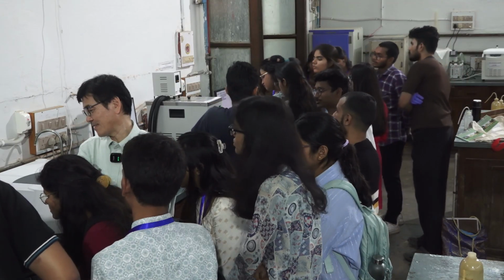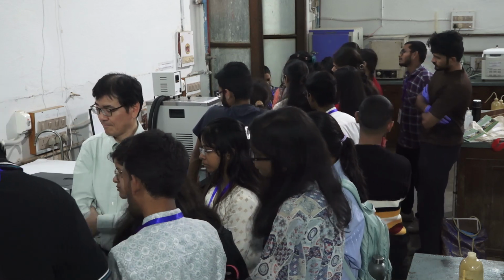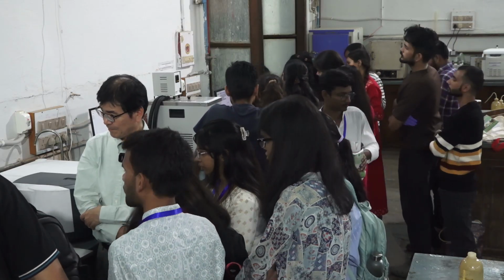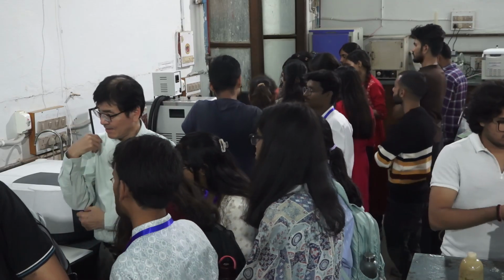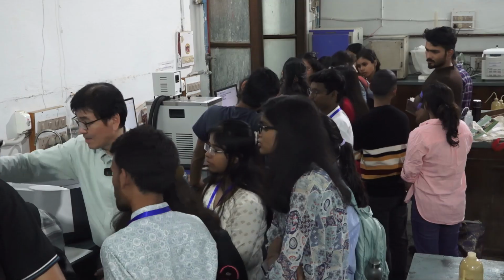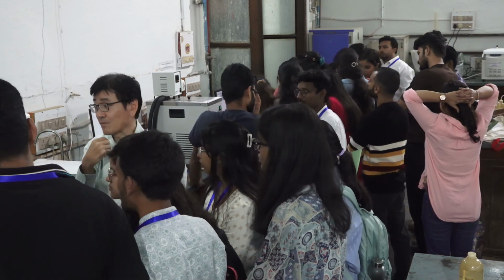Please always put the same volume. And please cap. Can you see? Okay, so gently rotate and approach. Already you see some negative peaks around here. It is not seen in the solvent spectrum.